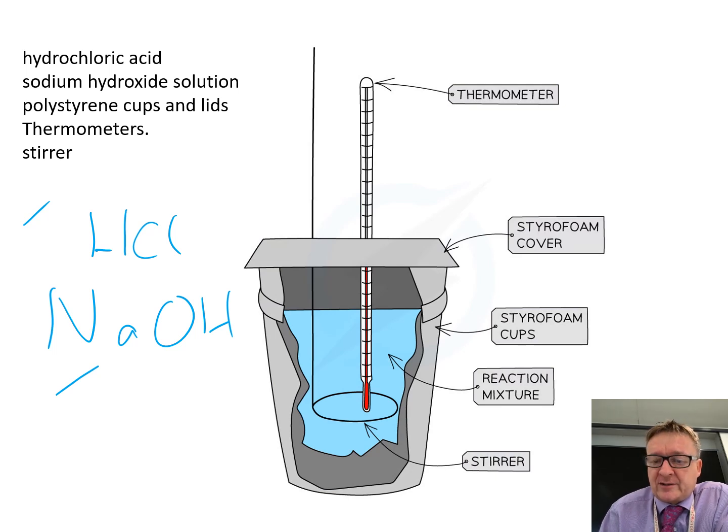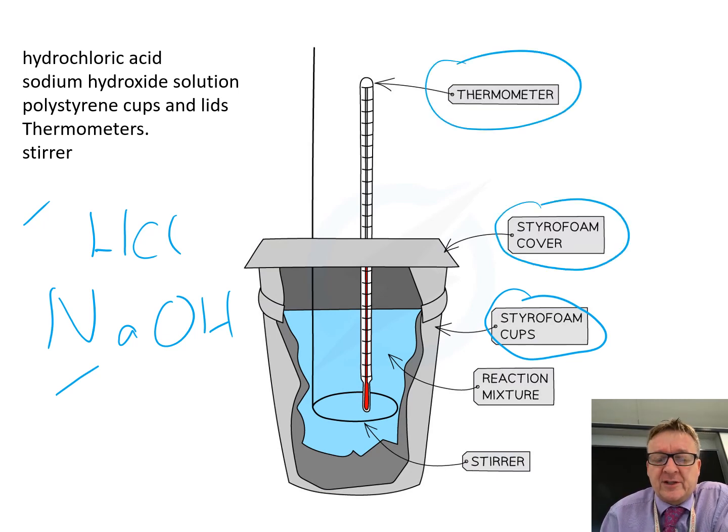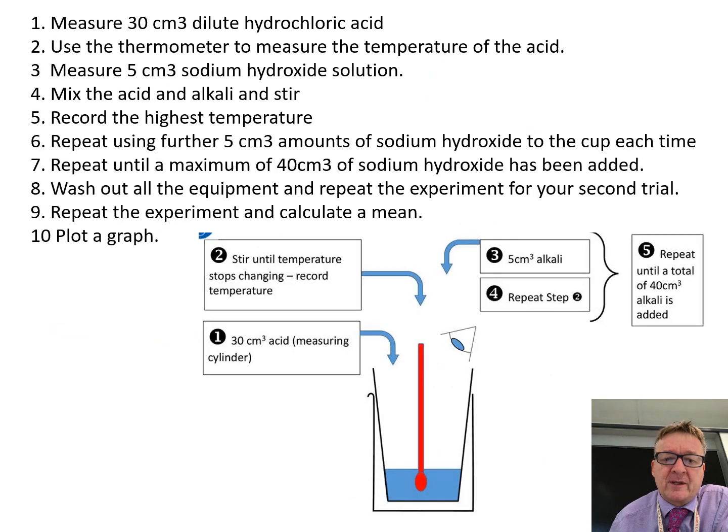Polystyrene cup and lids. It's put on here styrofoam, okay, I normally call it polystyrene, and a styrofoam cover. The thermometer that then goes into the liquid, and a stirring rod to make sure that the mixture is mingled together so you can get the correct results.